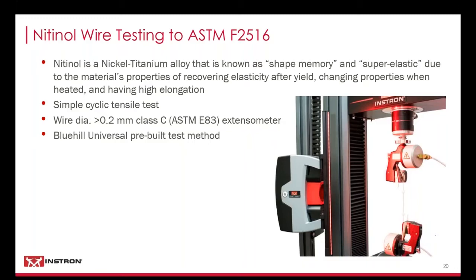So nitinol is a really commonly used material in the biomedical industry for two reasons. One is its shape memory, and two is its super elastic properties. Super elasticity makes it ideal to be used in stents that would be used during an angioplasty procedure. It's able to compress while it's being placed and then expand to its original size once deposited in the artery.